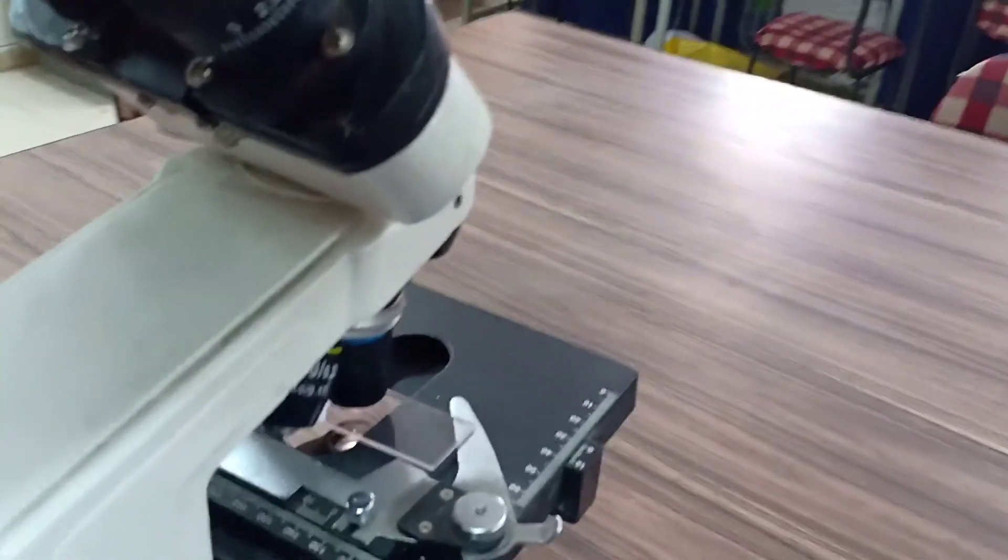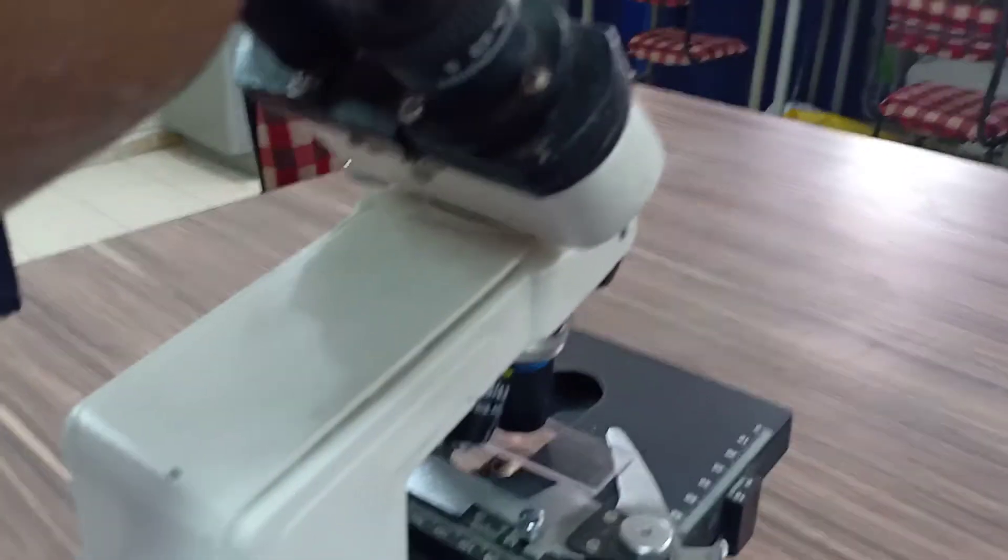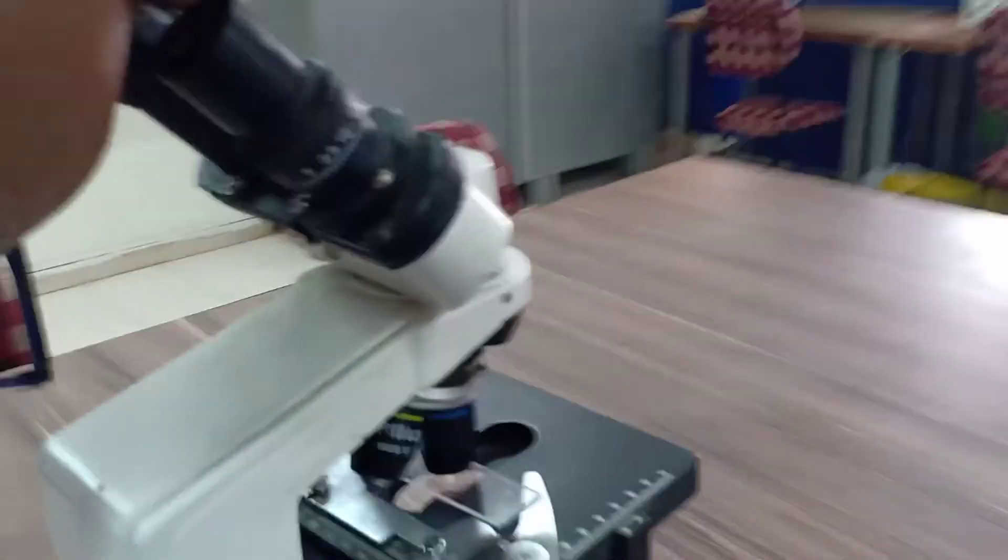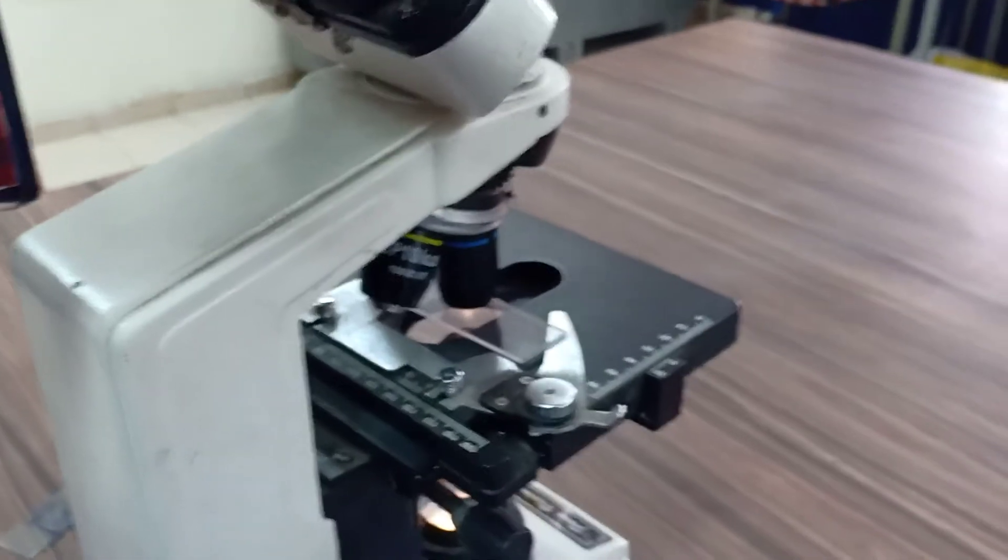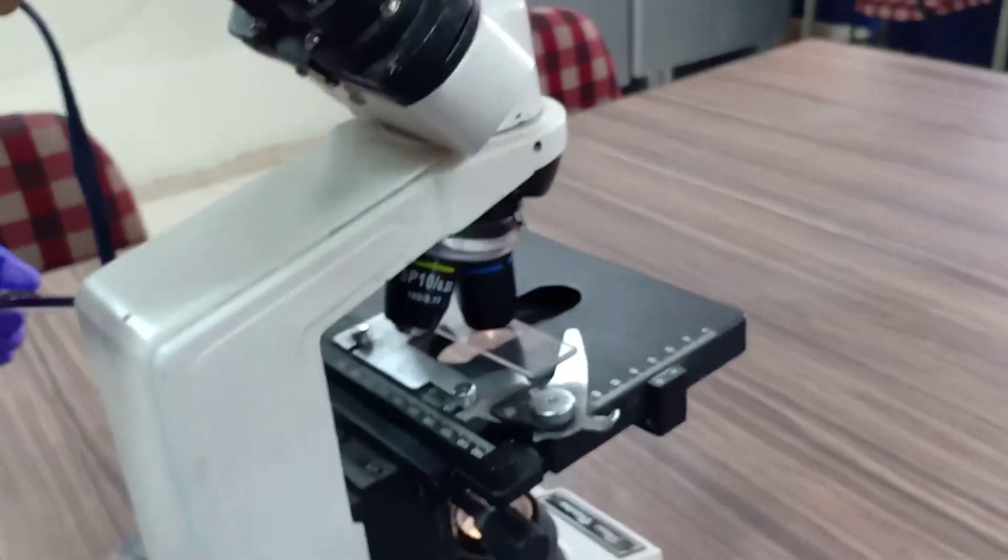You can observe through the microscope and you can take a fixed slide. With the help of that, take a photograph with the help of your mobile camera. You can take a result. That is the process of gram-staining.